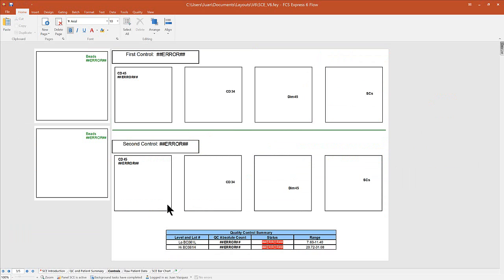Now, chances are these plots here are just a means to an end. So basically, I want to take these plots and I want the software to actually do the work for me and try to summarize my data and do any number crunching that's available or needs to be done as part of my data. So in this particular sample, I have a set of 4 tubes.